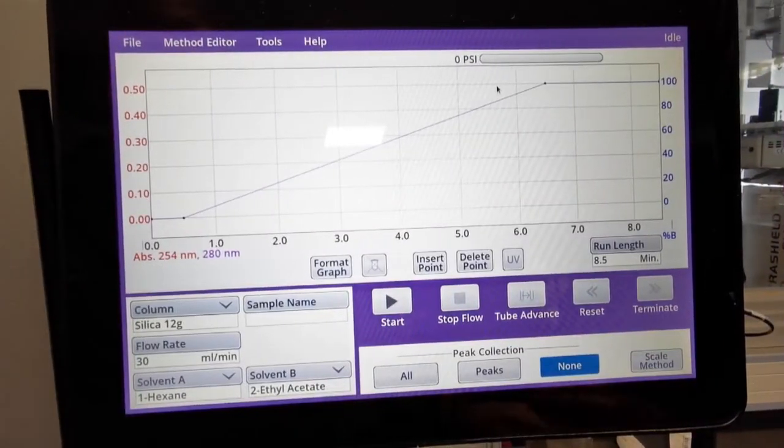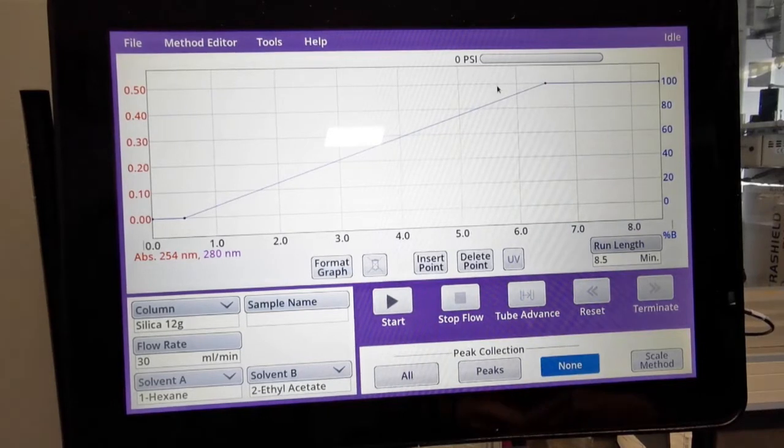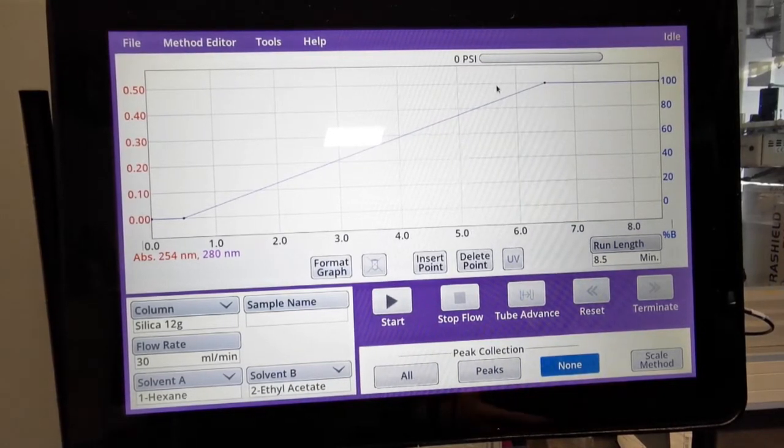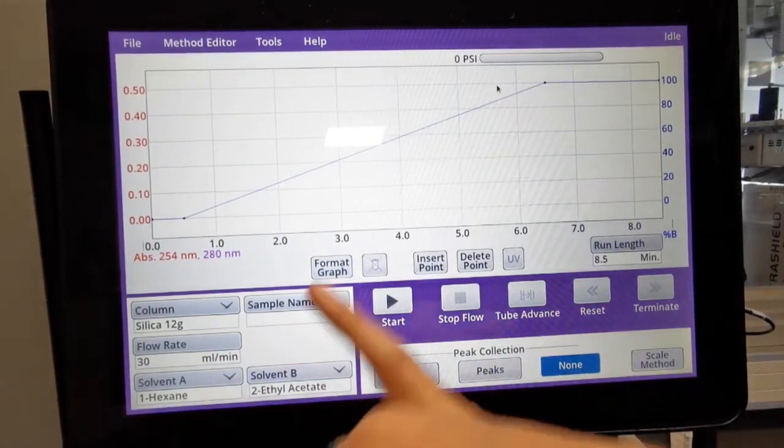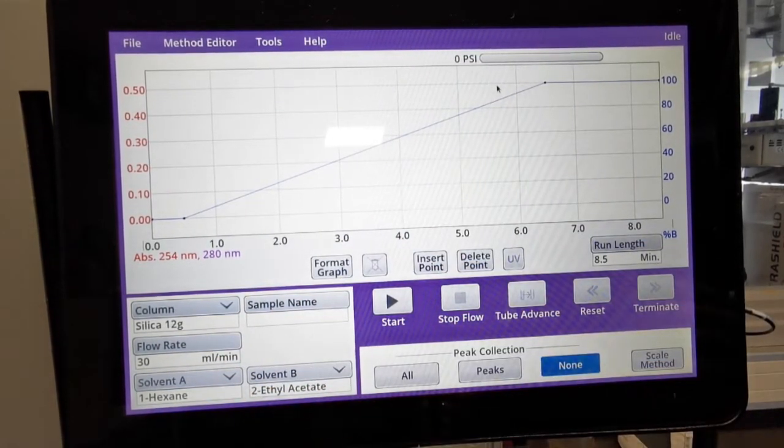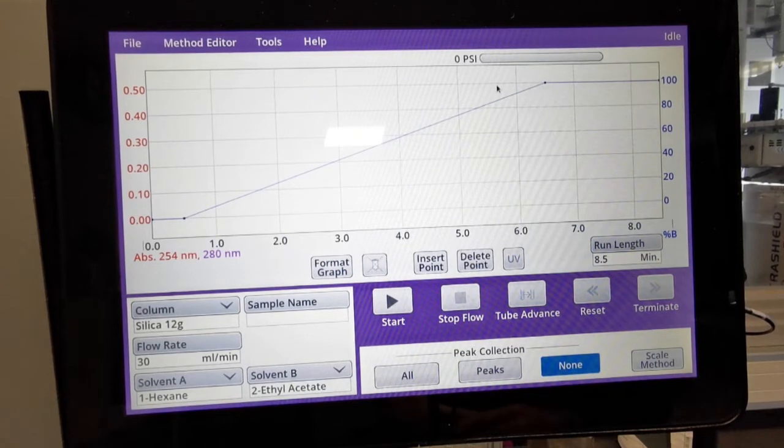So here we are on the front screen of our next-gen 300 plus. As you can see, we've got a normal phase silica column and it's set up with a default gradient using hexane ethyl acetate.